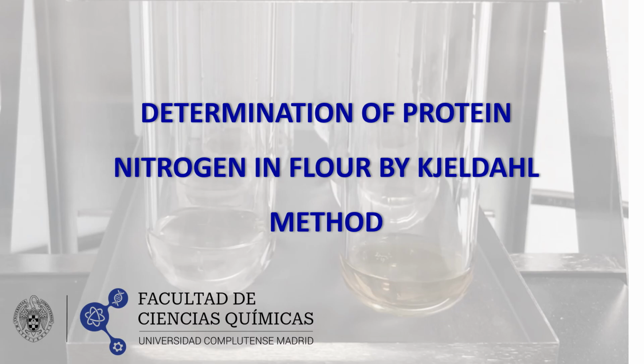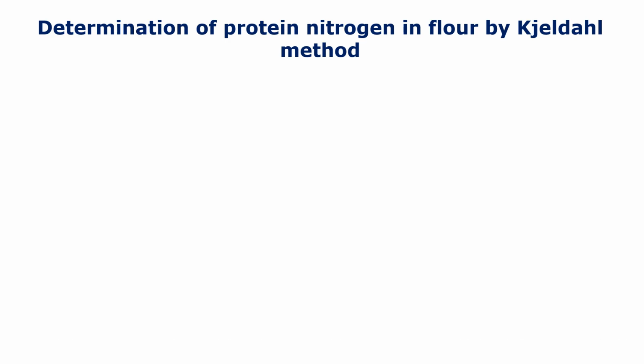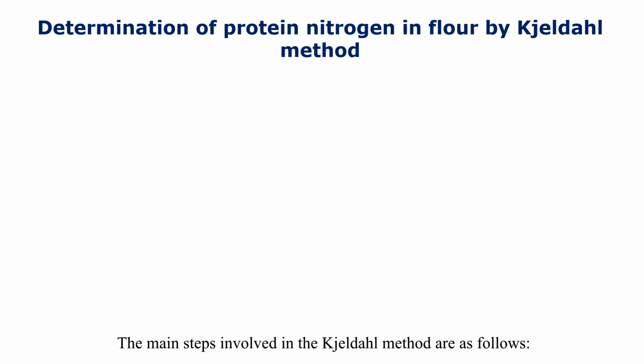Determination of protein nitrogen in flour by using the Kjeldahl method. In this practice, the nitrogen content and protein percentage in a flour sample will be determined. The main steps involved in the Kjeldahl method are as follows.